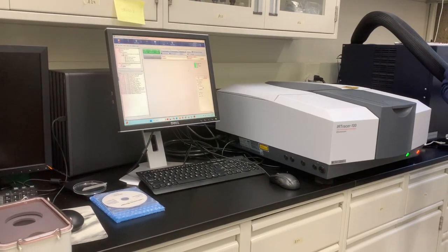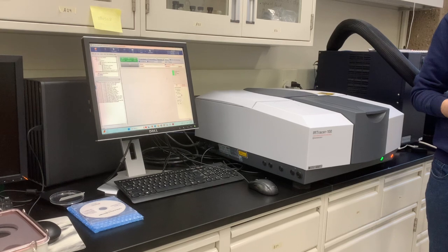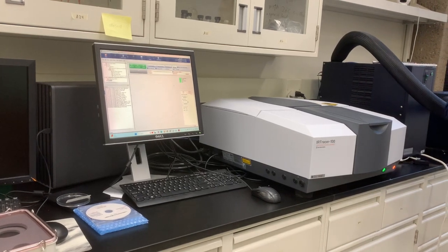It takes some time for the machine to warm up, for it to stabilize. Yeah, okay. But is it advisable for it to be running? It should be plugged in just for this feature, just for the dehumidifying.